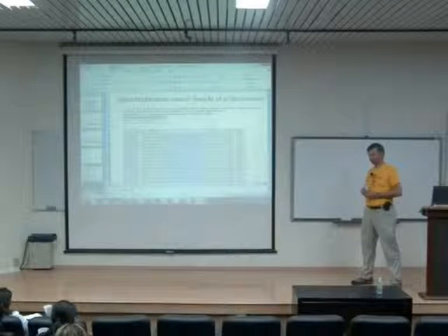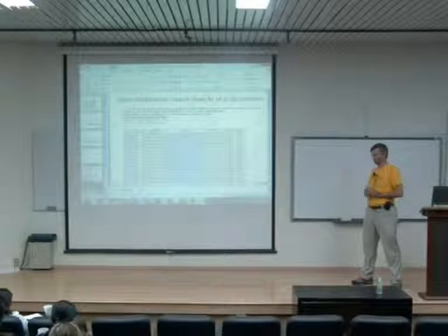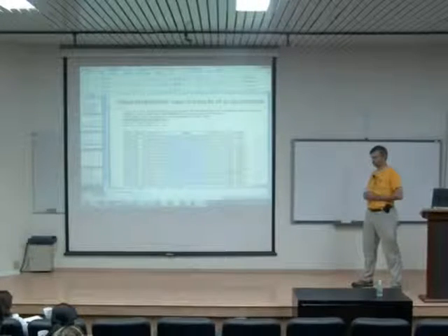From the lecture given yesterday by Professor Pauline Rudd, we know that the ratio of the structure of the glycans in IgGs, in antibodies, is important. In each antibody, the structure of both glycans is relevant. But if we perform the profiling by HPLC, by hydrophilicity, we can't know which glycan is in each position. By mass spec, I think, by glycopeptides, we can identify the structure. But in the case of IgGs, how can we know which glycans are on each side? Because the molecule is symmetrical.